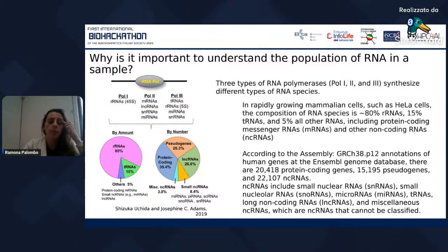And so they represent about the 35% of all the possible transcript in a mammalian cell. So the ability of the wet lab protocols and procedures to enrich the samples with the RNA species that we are interested in is very important, could be very crucial.